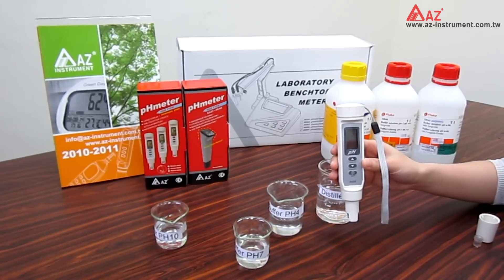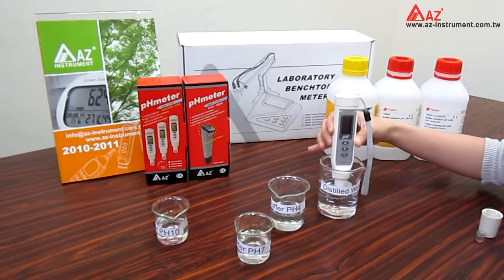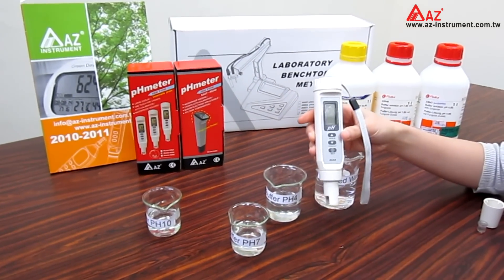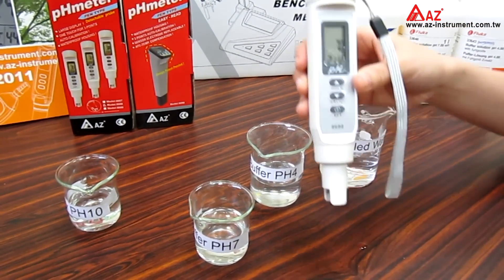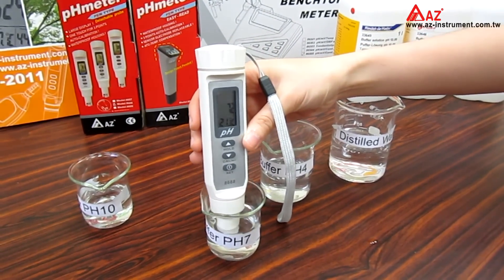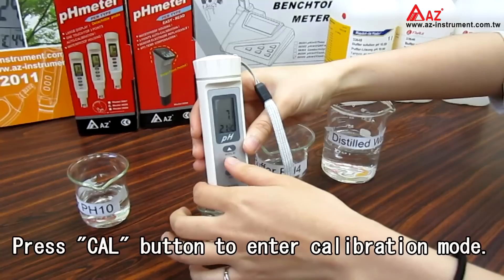Now, let's start. Just rinse the electrode with distilled water to clean it. Then turn on the meter. Dip the electrode into the standard buffer and slightly stir. Then press the CAL button to enter calibration mode.